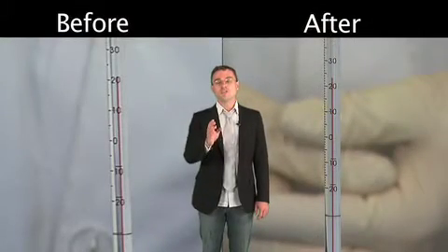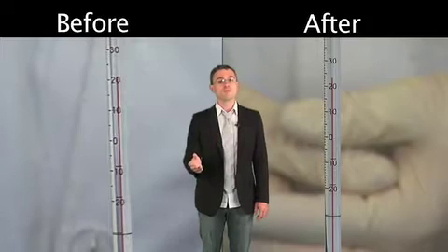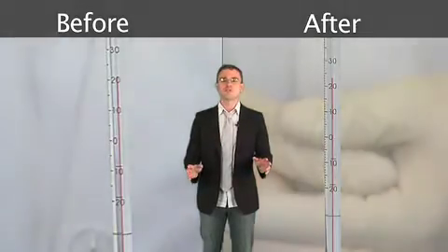The Bullet Blender uses an innovative technology to keep your samples cool while they're being homogenized. Temperatures rise just a few degrees.